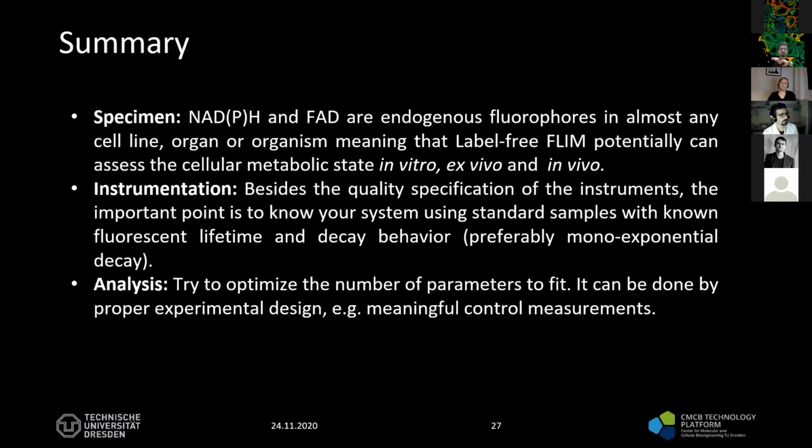And if you fit also the IRF shift and the background and so on, you have something like 10 variable parameters, which ends up in an enormous number of degrees of freedom statistically. It is not my saying, somebody said it: you can fit an elephant with multi-exponential decay algorithms. So it's important to have meaningful control measurements.